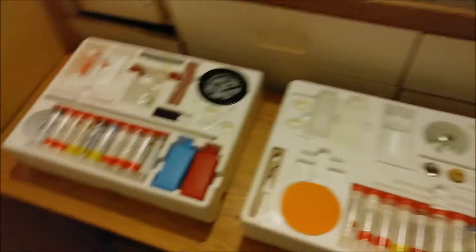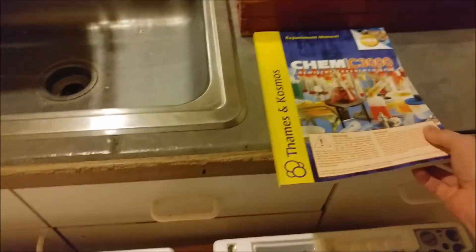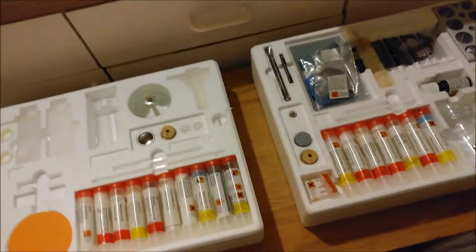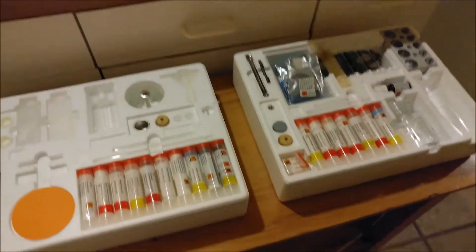Okay, this is the newer kit. It is a Thames and Cosmos Chem C3000 kit. This one is a bit older — they made an updated newer version, but rather than having three individual packs, the newer one only has two. So the newer one actually has less material, which is one of the few cases where I'm happy to have the older version.